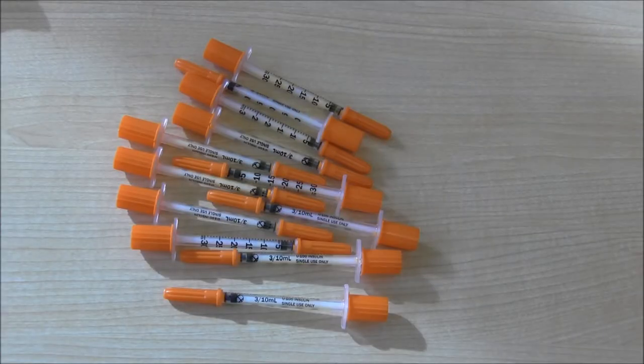Now that we've mixed the elastomer and loaded them into the syringes, we can take these and store them in the freezer until we're ready to go out into the field. By keeping them in the freezer, they can last up to one to two months before being used without hardening. The warmer they're kept, the faster they'll harden and become unusable.